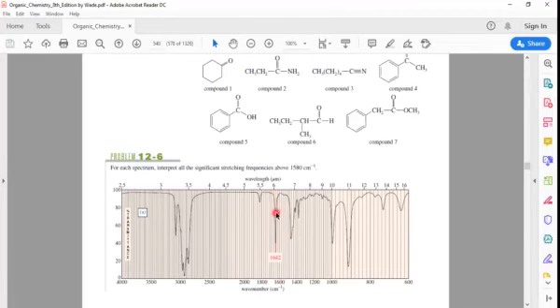It is in the region of carbon-carbon double bond stretching. So overall, this is a simple spectrum having an aliphatic region and an alkene as well, with carbon-carbon double bond stretching absorption and carbon-hydrogen stretching where the carbon is sp2 hybridized.